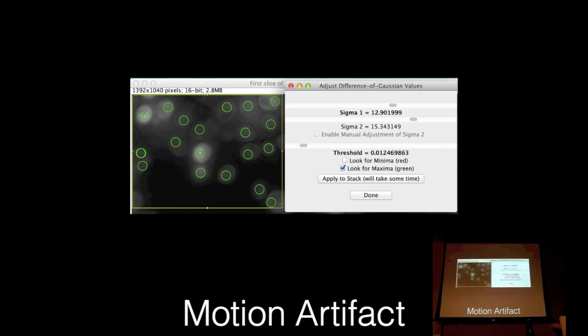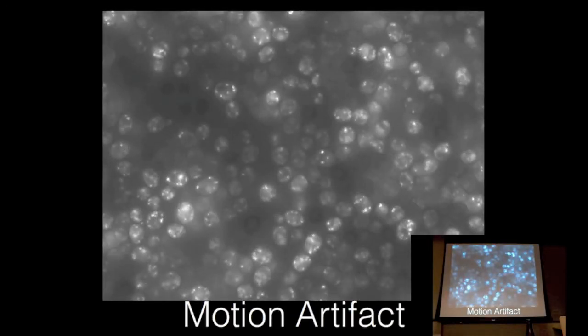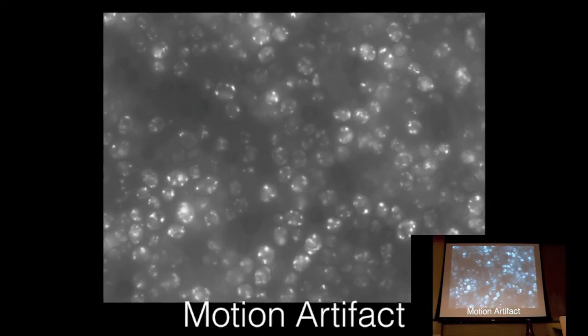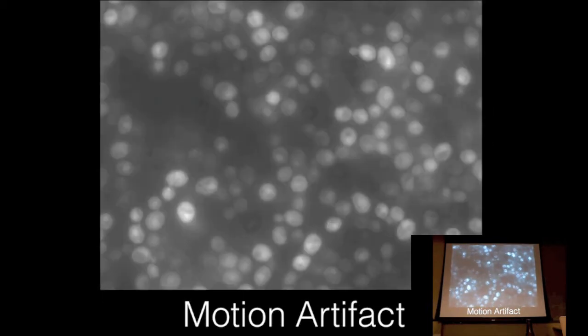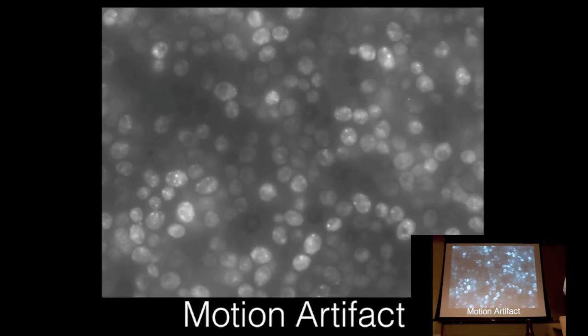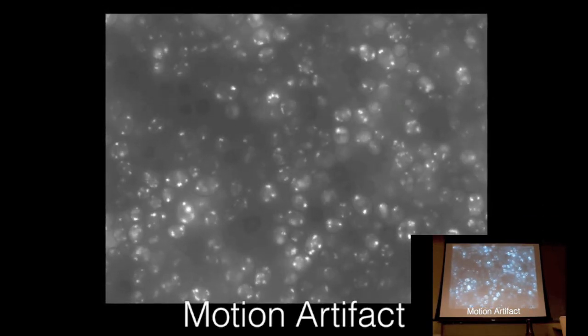Once you set this up, you can adjust the size to make the sigma about the size of the cell, and you can see it's detecting where the cells are. You can slide this threshold up and down to set it so it's selecting about the right cells. The bottom line is that after you run it, you get a movie like this, which has basically no shaking other than the shaking of the actual cells themselves, as well as the edges, because of course when you correct and slide the movie back and forth, the edge of the frame moves.